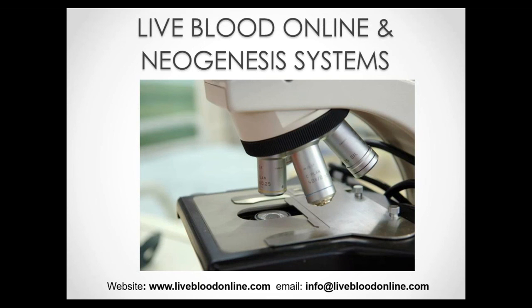In conventional hematology, the blood is, of course, drawn from a vein. It's placed in a little test tube with an anticoagulant, and then the blood is sent off to a laboratory where a different technician will actually look at the blood under a microscope. But before analyzing the blood, they stain the sample and basically kill all the blood cells to preserve the sample. So you could say that conventional hematological testing, what they call a peripheral blood smear, is a much cruder type of analysis. It's performed on essentially dead blood at a very low magnification, and there is a lot of damage that the blood cells undergo as a result of the sampling process.